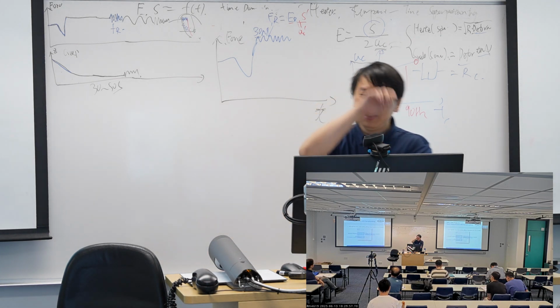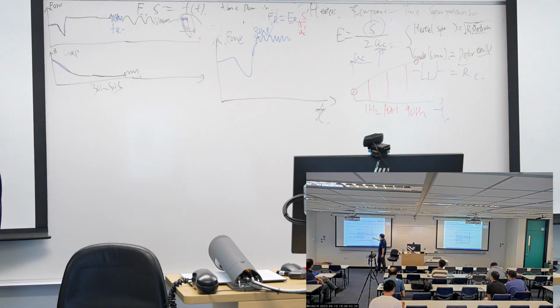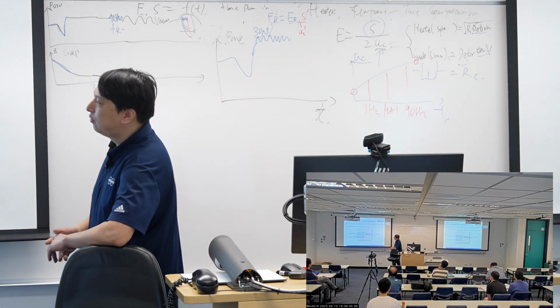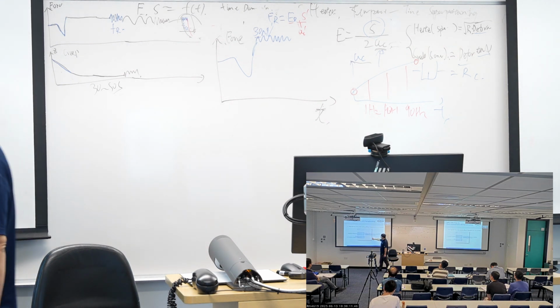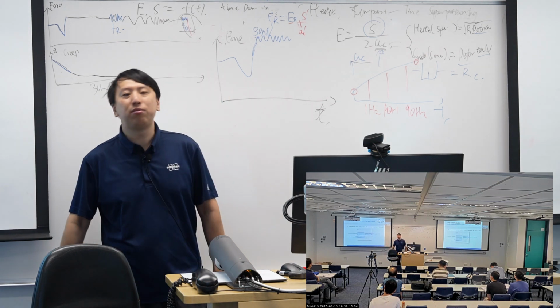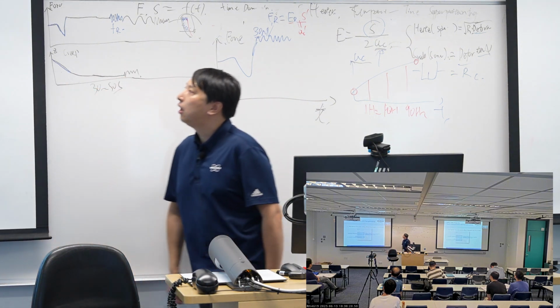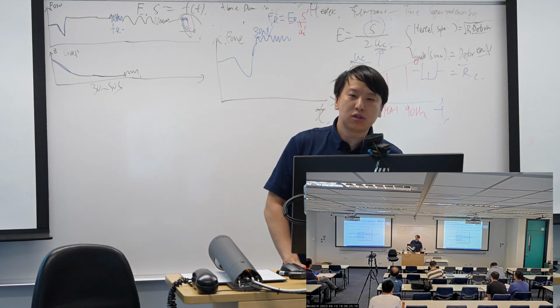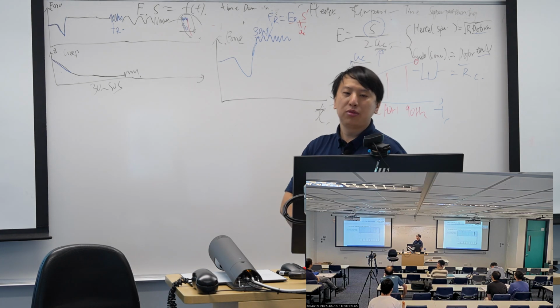Okay, and for here, we need to define the ramp size, which is the same as the force curve, and the velocity, and we need to define the relaxation segment time. Let's let it creep, and the other stuff we can explain in our hands-on sessions. That's about the nanoDMA spectroscopy. And this is done using the ramp scripting.